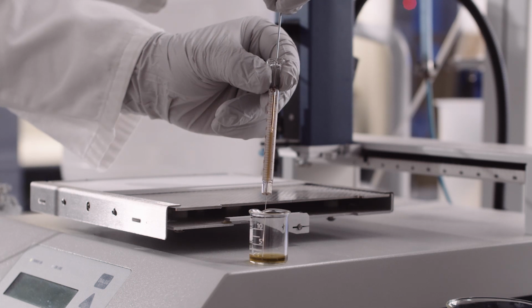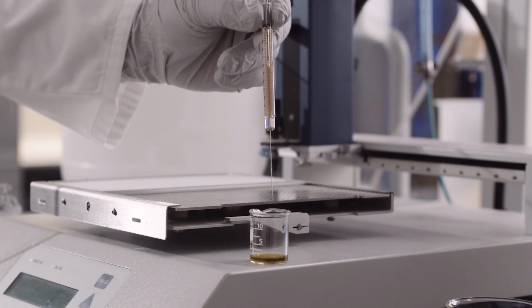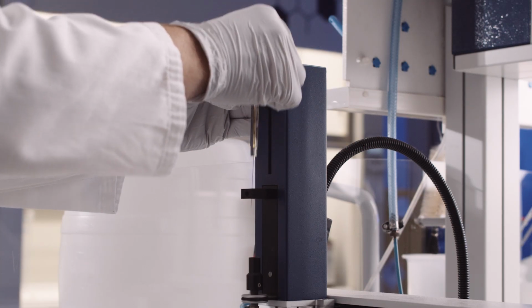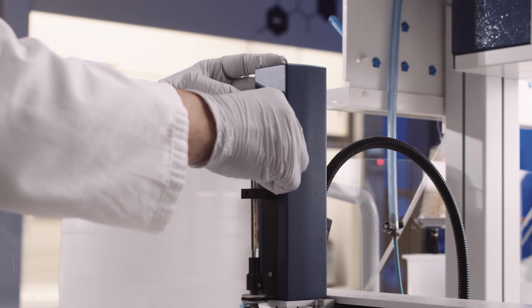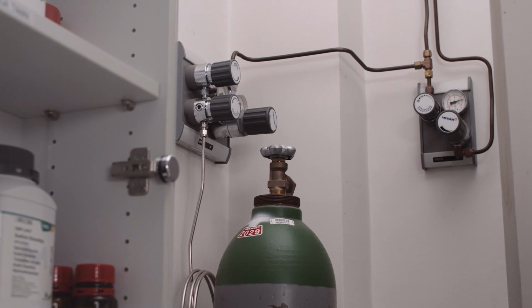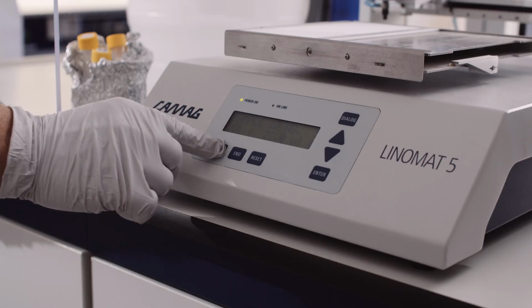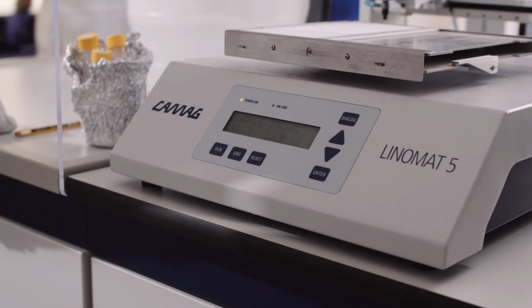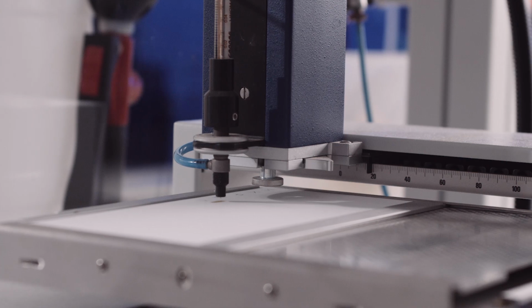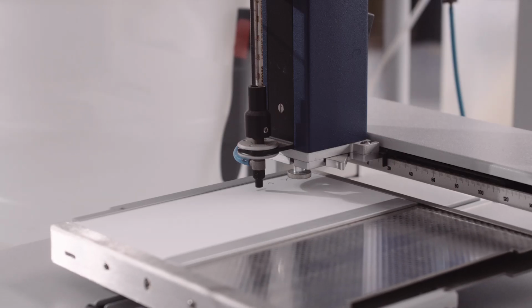TLC is a simple chromatographic technique used to identify compounds, check their purity or monitor the course of chemical reactions in synthesis. It is significantly faster than column chromatography, and much less sample is needed. Chromatographic separation takes place on a stationary phase, which is usually a thin layer of silica gel, SiO2, alumina, Al2O3, or cellulose. The stationary phase is applied to a plate made of an inert backing.